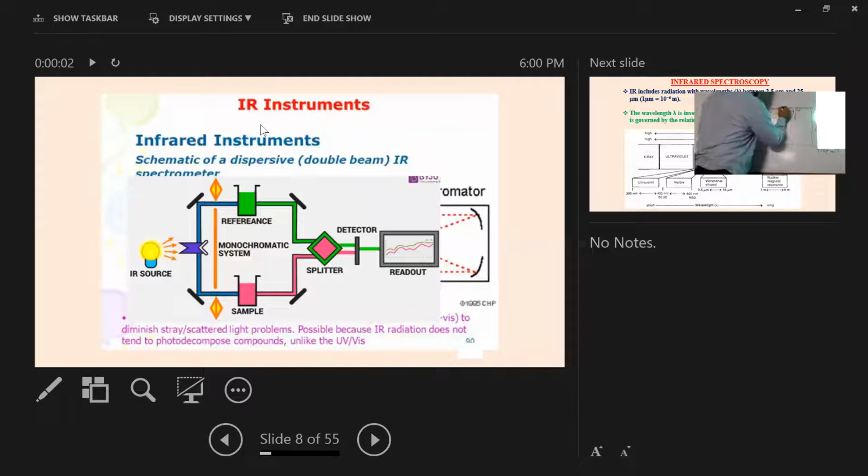Okay, maybe not exactly flat like this up and down, but if the quality of the instrument is good, in that case, this line should be quite flat or quite straight. But that is not very necessary, because for these types of vibration, if you want to detect what types of vibration you have, if you have something like this, still you can identify this one, is it? That is fine.